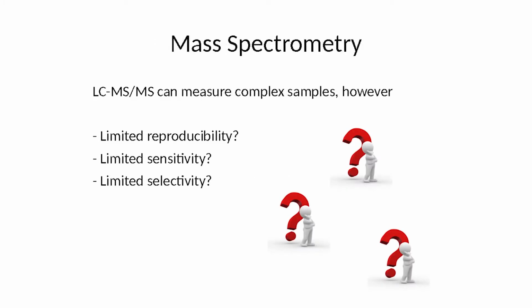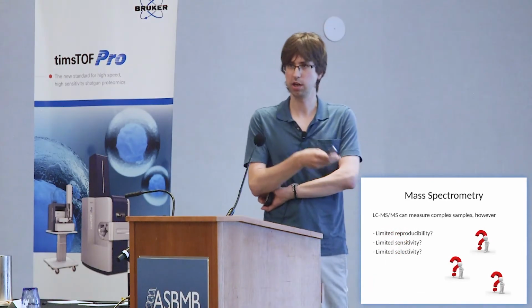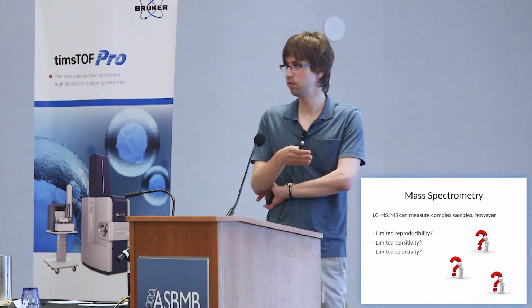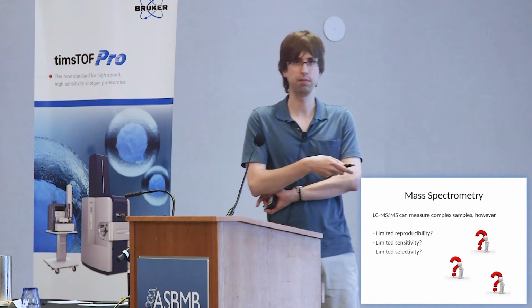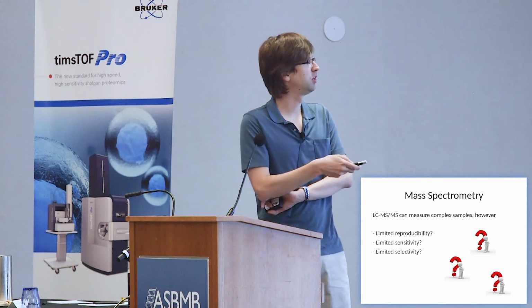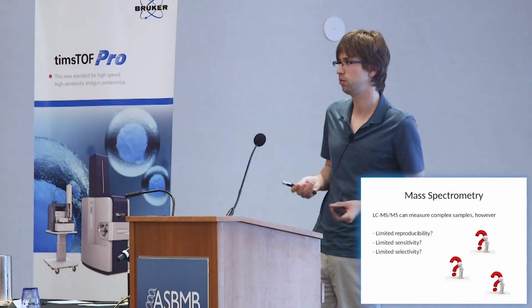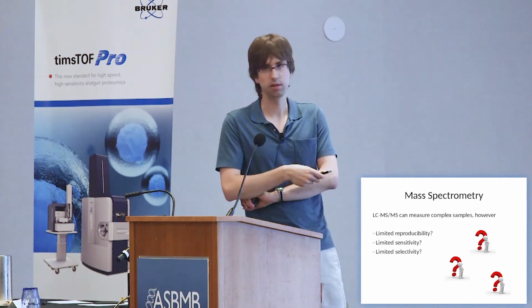So we can already measure relatively complex samples. However, we are often faced with challenges in the area of reproducibility. Can we measure the same analyte reproducibly across dozens or potentially hundreds or thousands of individual samples? This is extremely relevant in a clinical context. We are challenged with limited sensitivity, because we don't have an amplification procedure for proteins, and of course, to some degree, with limited selectivity.